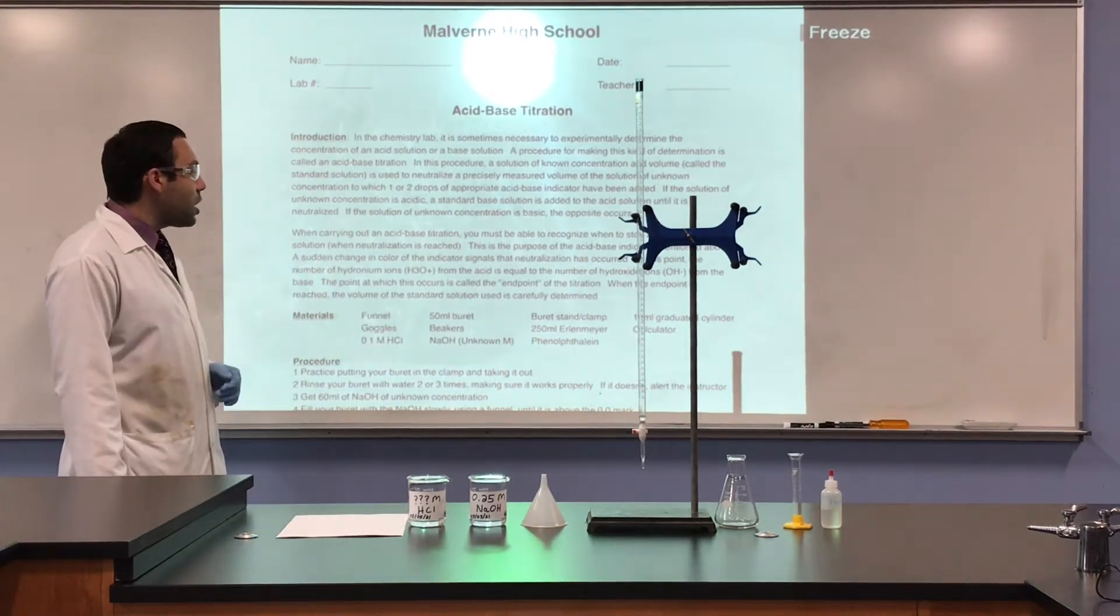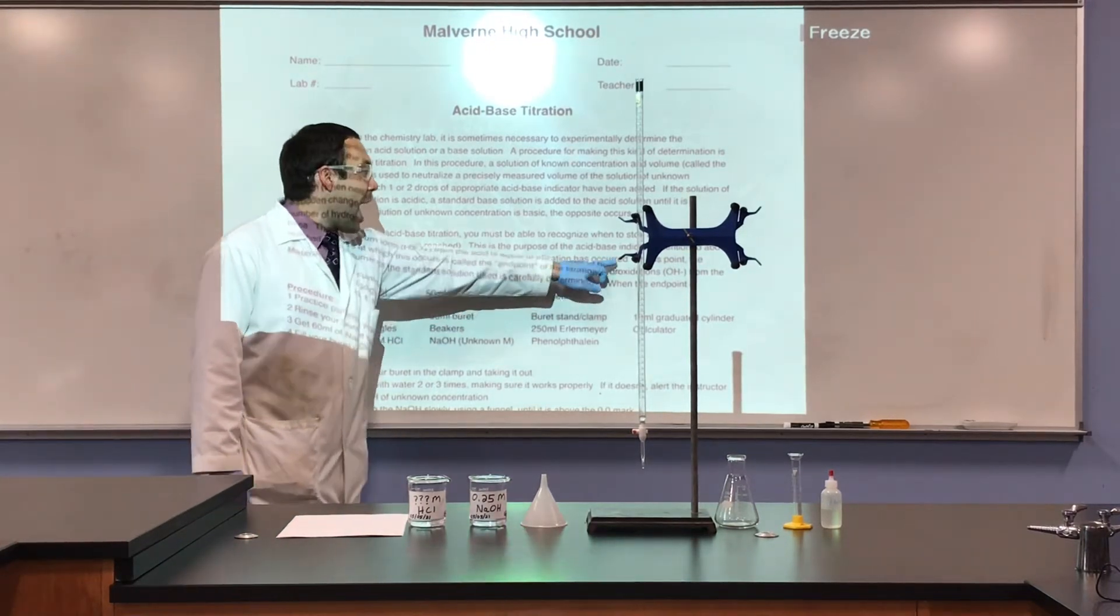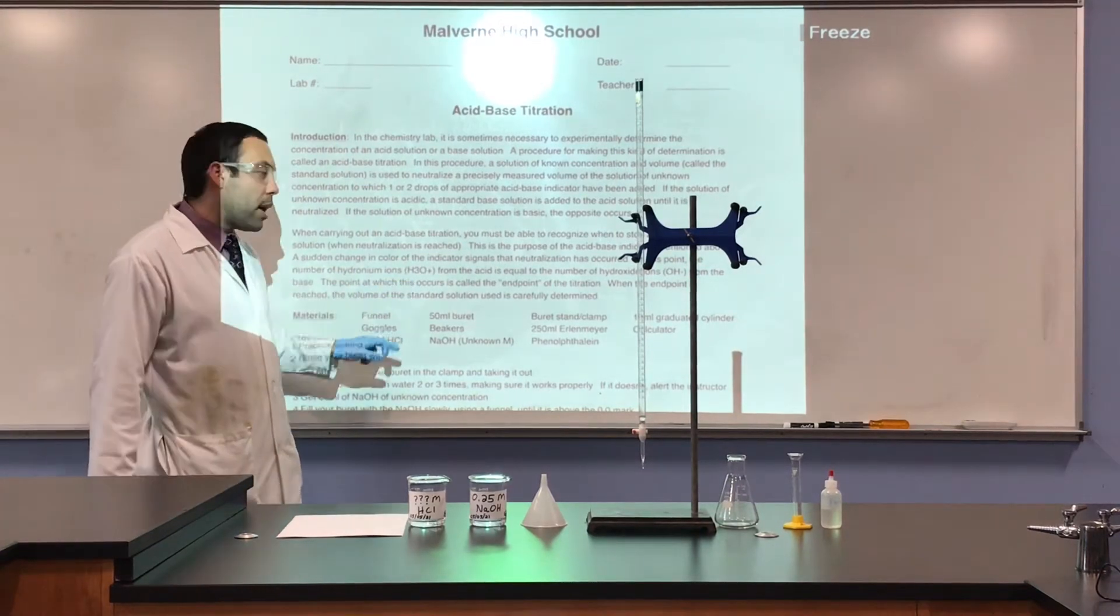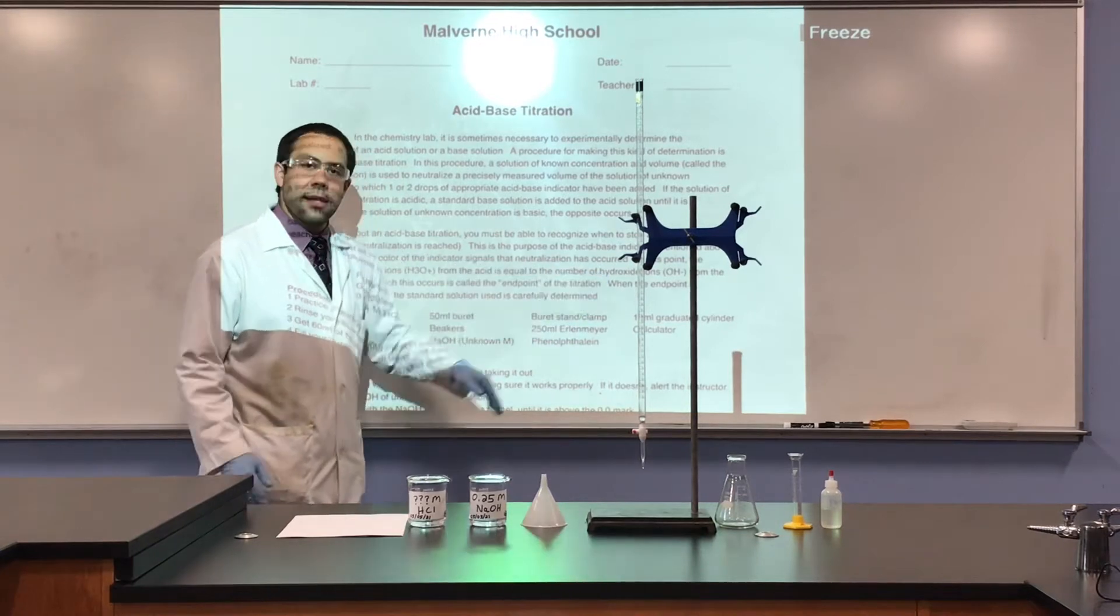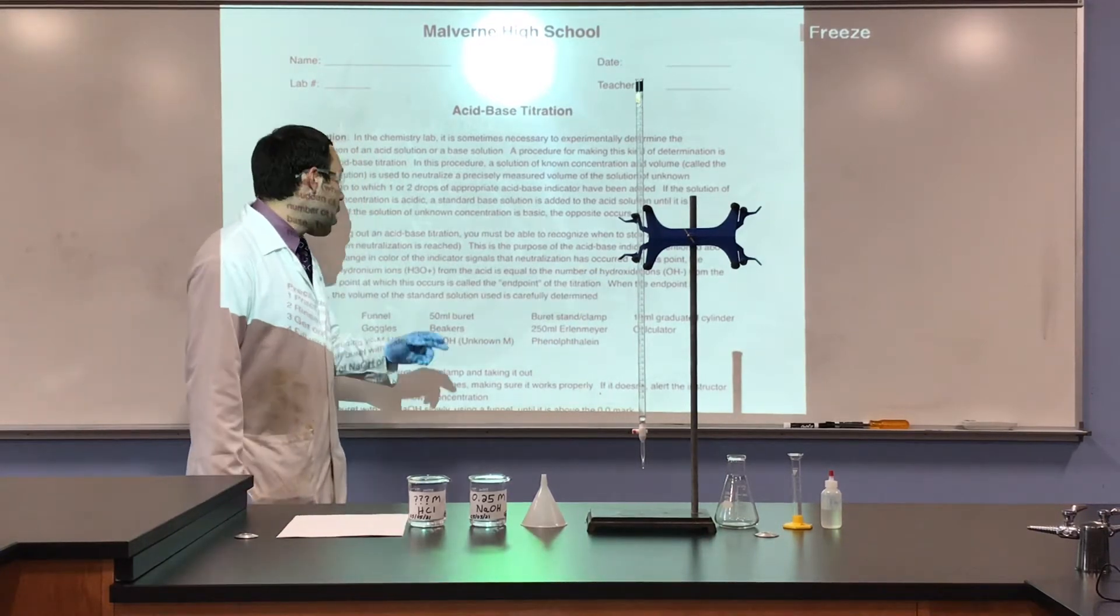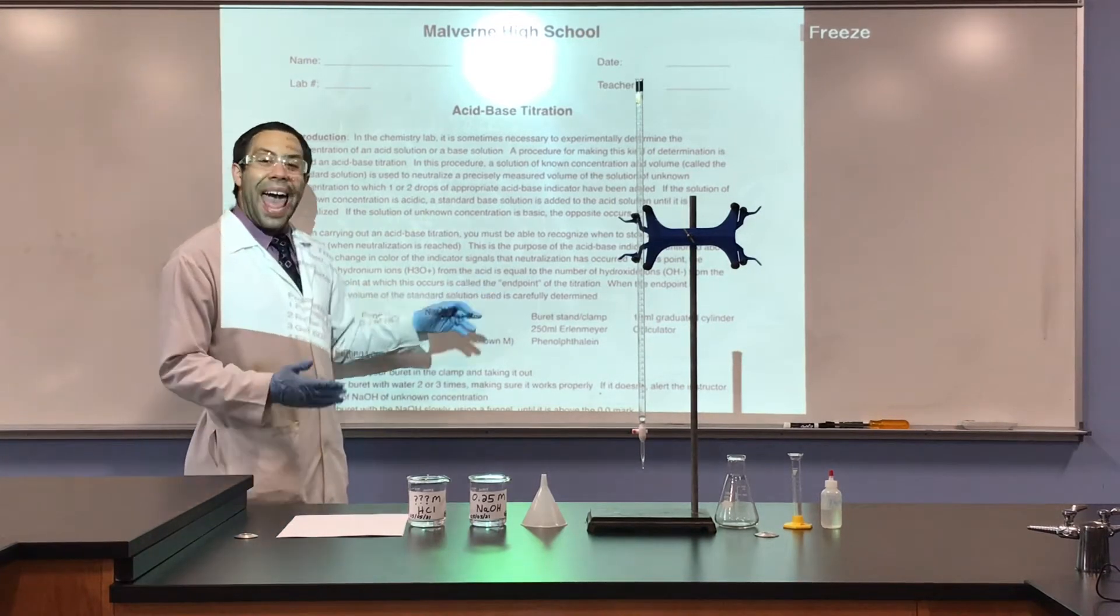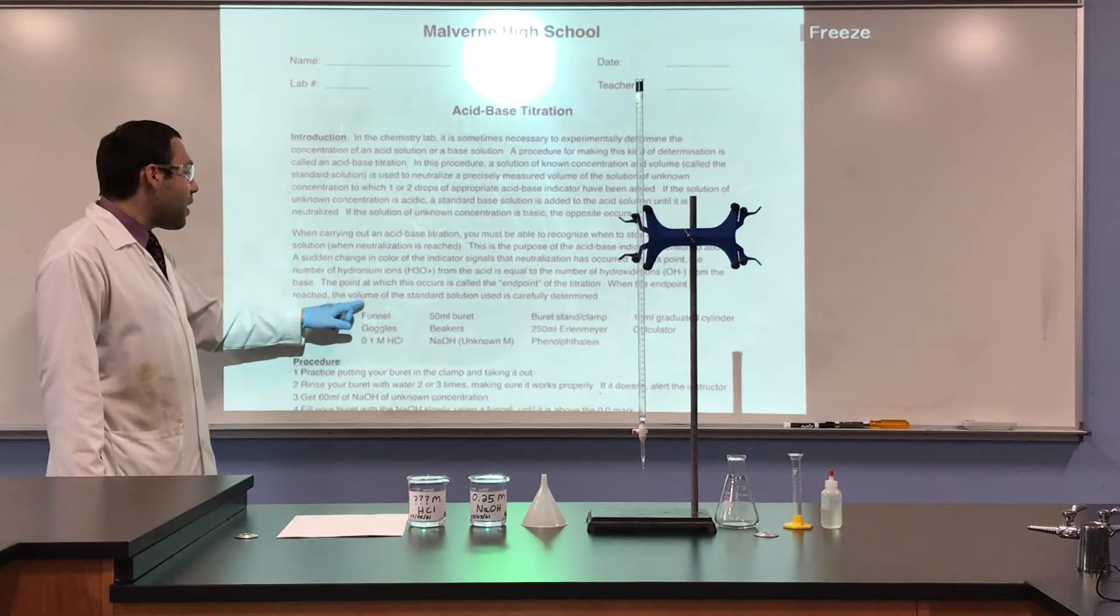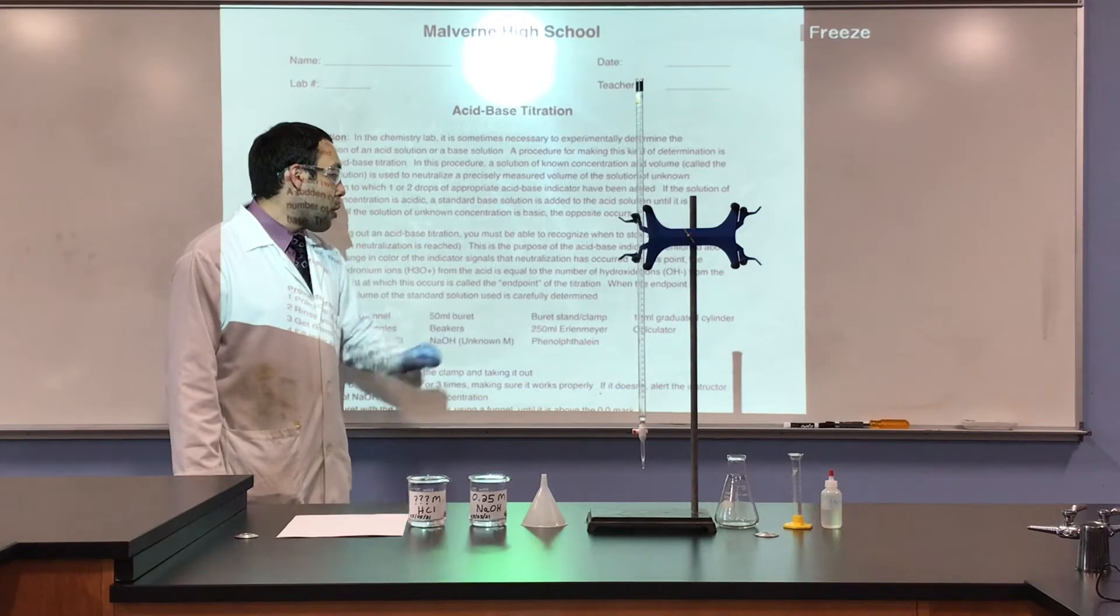This is the purpose of the acid-base indicator mentioned above. A sudden change in the color of the indicator signals that the neutralization has occurred. At this point, the number of hydronium ions, H3O+ ions, from the acid is equal to the number of hydroxide ions, OH- ions, from the base. The point at which this occurs is called the end point of titration. When the end point is reached, the volume of the standard solution used is carefully determined.